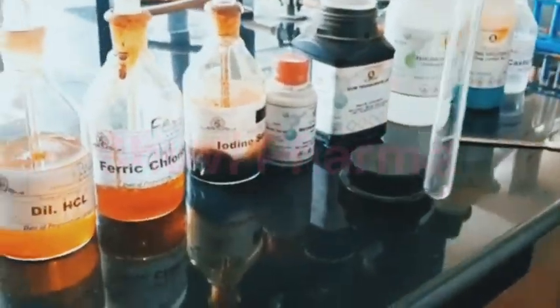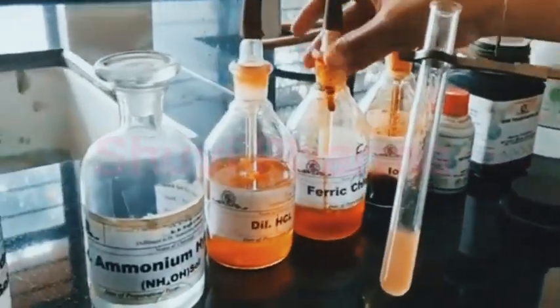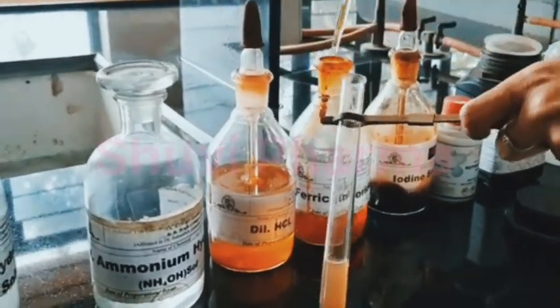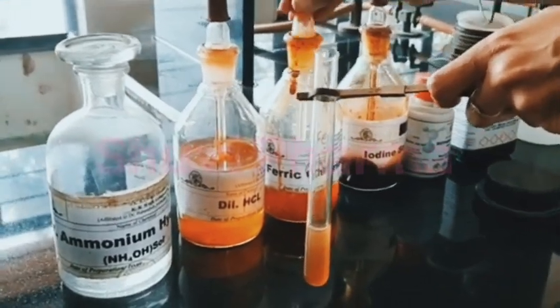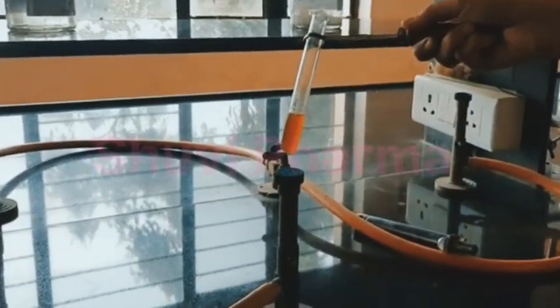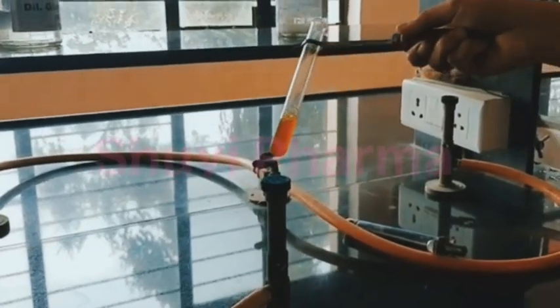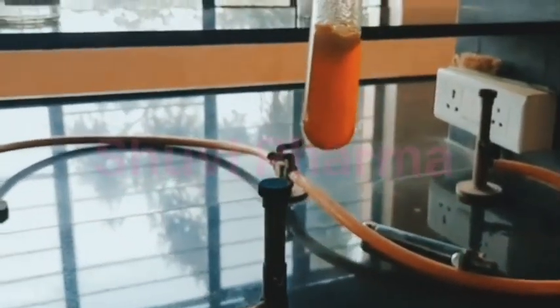For the next, the ferric chloride test, we will take the test solution in the test tube. To that we will add ferric chloride solution. And we'll boil on a burner. Here you can see a deep yellow precipitate is obtained that indicates the presence of tragacanth.